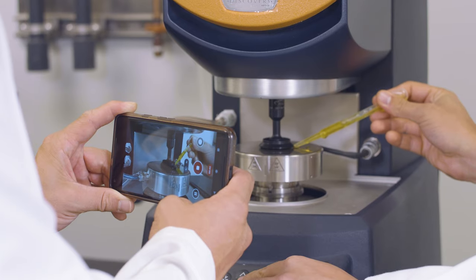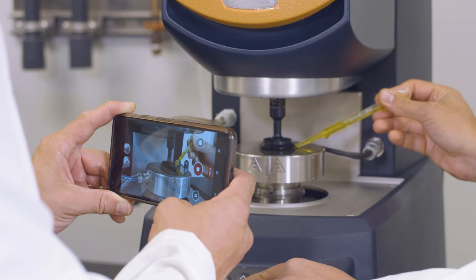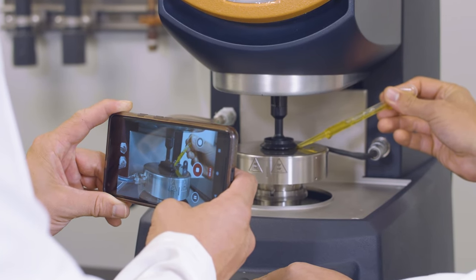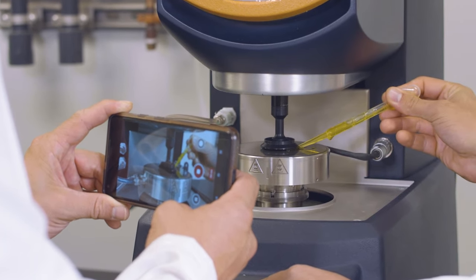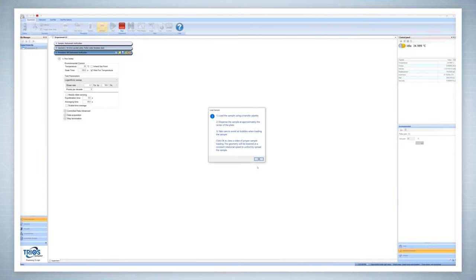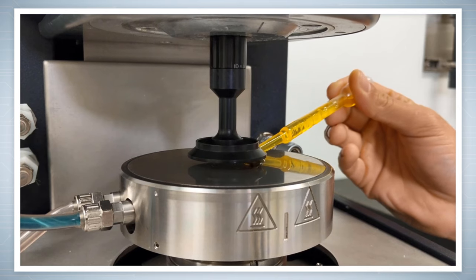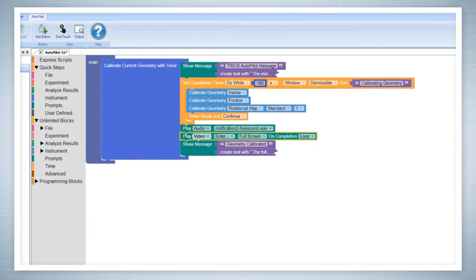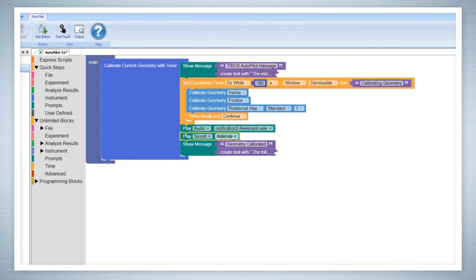Through Autopilot, use your own videos to provide visual aid in proper instrument operation, with no additional training required. Program timers and audio cues into your scripts to call operators to action, no matter where they are in the lab.